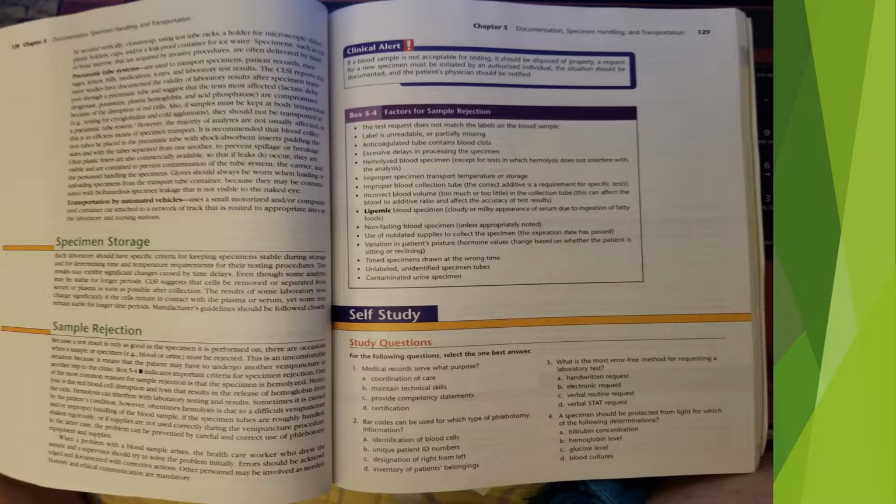Transportation by automated vehicles uses a small, motorized and/or computerized container car attached to a network of track that is routed to appropriate sites in the laboratory and nursing stations. Specimen storage. Each laboratory should have specific criteria for keeping specimens stable during storage and for determining time and temperature requirements for their testing procedures.